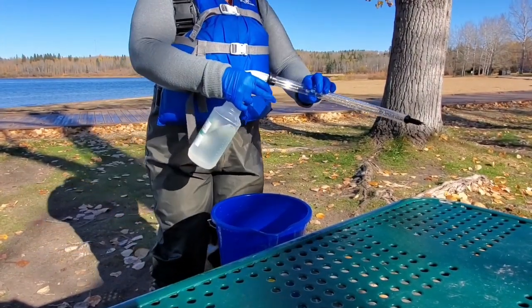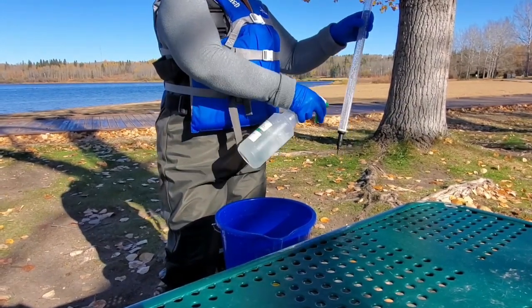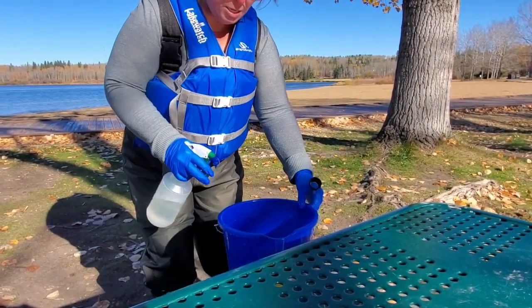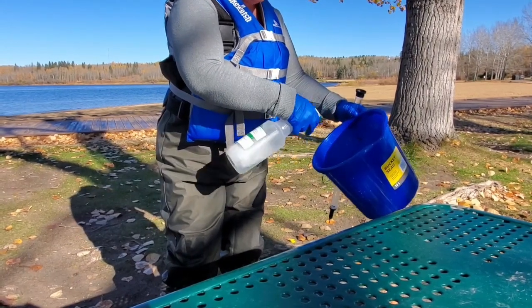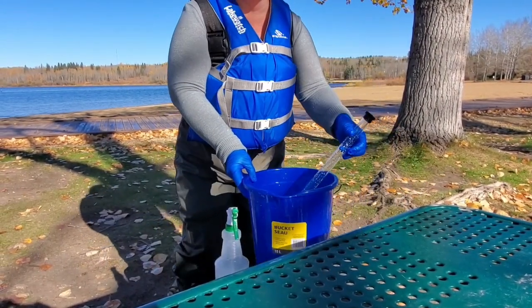If you will be sampling more than one lake in a day, be sure to fully disinfect any equipment that was used in the lake, including waders, the pail, and the wine thief, so as to limit the risk of spreading invasive species or disease between lakes.